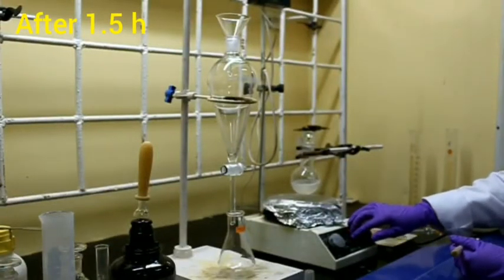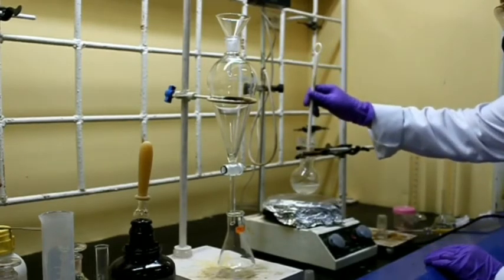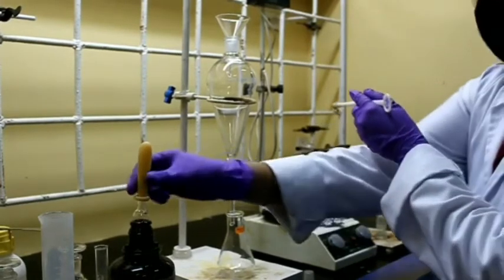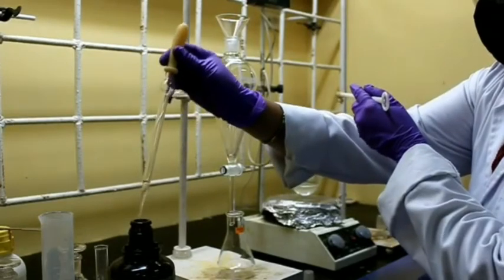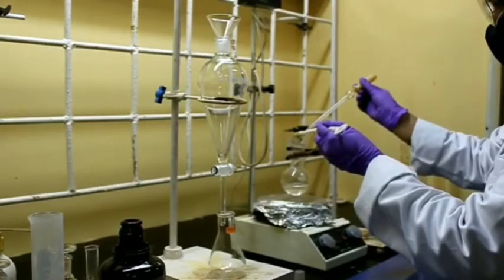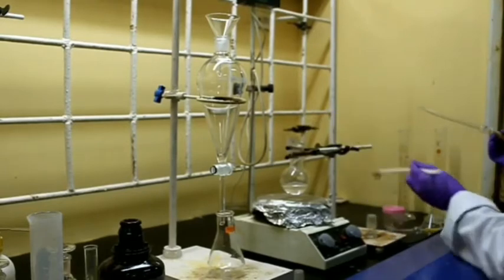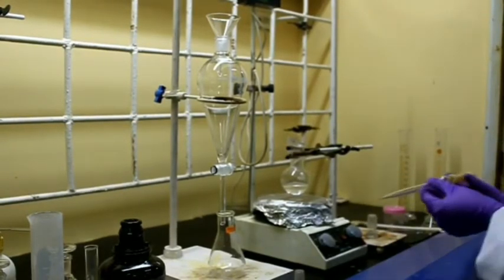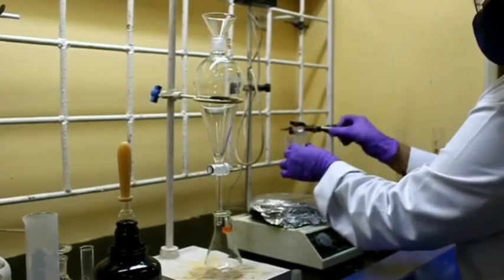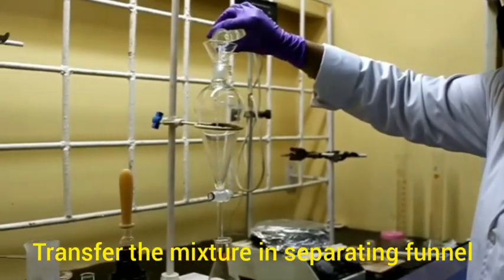After 1.5 hours, we stopped the reaction and removed the magnetic bead. We washed the magnetic bead with ethyl acetate. Then we are transferring the reaction mixture into the separating funnel.